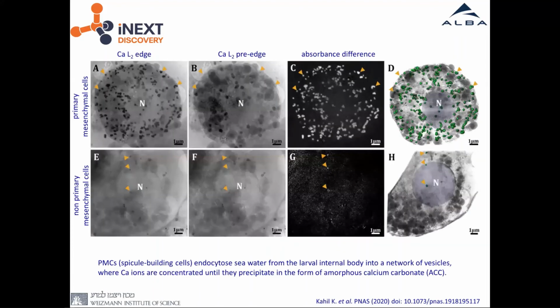And by tuning the energy at the beamline to the calcium L2 edge, you are able to get a differential absorption between what is calcium and what is not calcium. And this is what is shown in the upper row here.